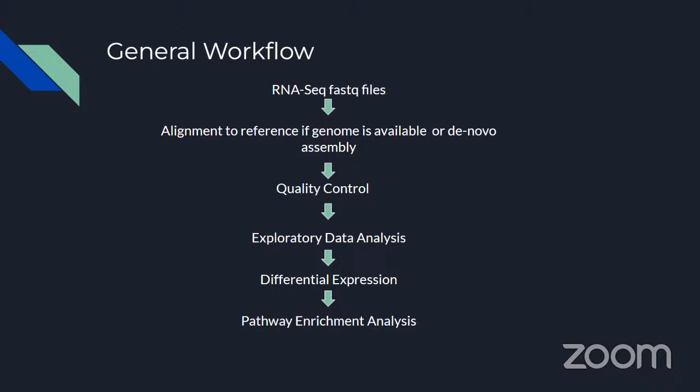Or if you want to discover new transcripts that are not present in the annotations, you would again want to do a de novo assembly.